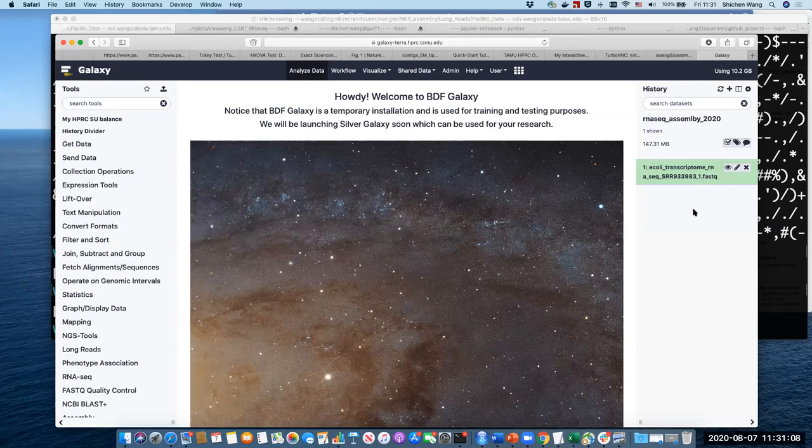You're good to start. So this is a FASTQ file. And as we talked before, when it's assembly, the adapters are gonna cause troubles, the low quality bases are gonna cause troubles. So we want to trim those. But before we do trimming, maybe it's good to check it, right? We want to see what's the problem in our data.